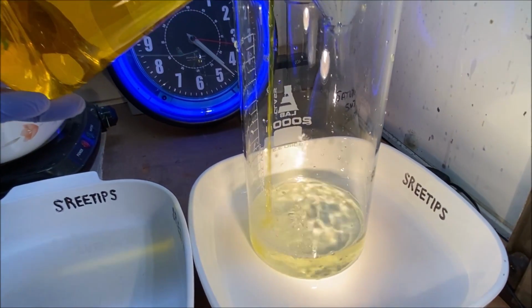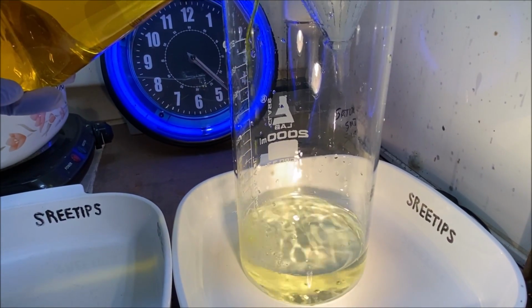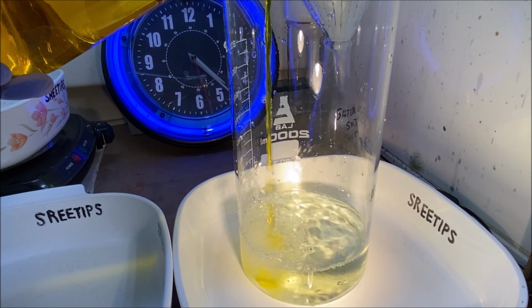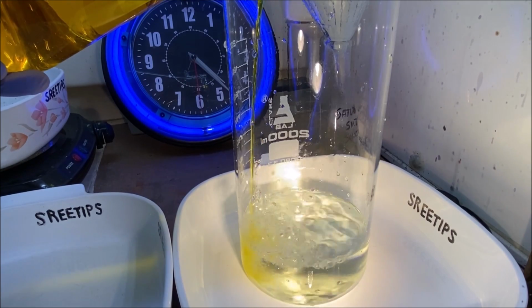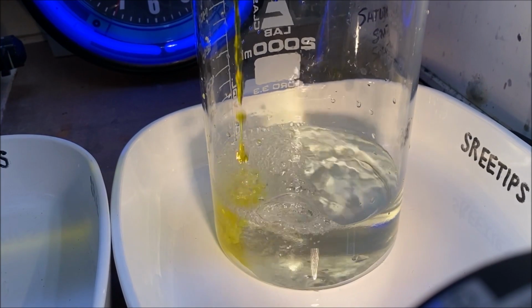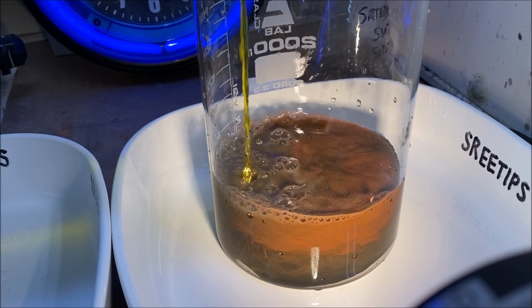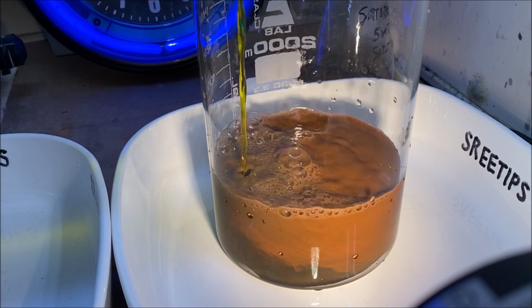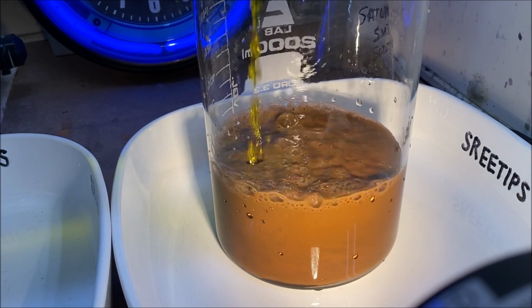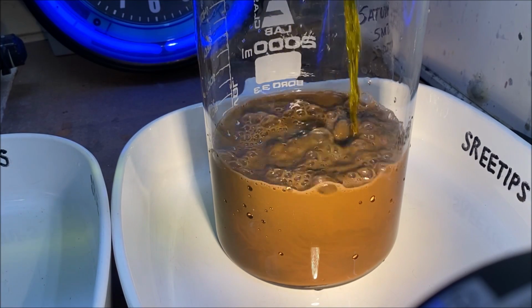Wow, look at that. Didn't expect to see that. That's pretty bizarre. It's going colorless. There it flashes over. All right, there's the gold coming out of solution as we continue to add it. Pretty neat. Do it a little differently. A little change up.